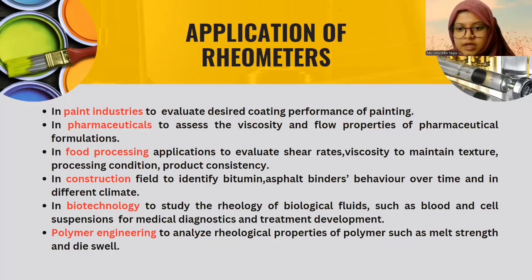over time and how they will behave in different climates on the road. Then in biotechnology, to study the rheology of biological fluids such as blood and cell suspensions for medical diagnostics and treatment development. And lastly, in polymer engineering, to analyze rheological properties of polymers such as melt strength and die swell.